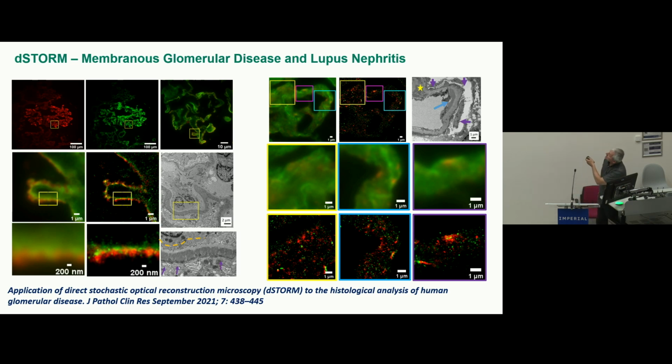We chose this area here in electron microscopy. These dark areas are equivalent to these deposits here in red. Here it is again. This arrow is the annotation of the pathologist. Here are the immune deposits, and this is the reconstruction with fluorescence. This sample takes about a day to prepare manually in the lab with conventional immunofluorescence techniques, primary antibodies. But a sample for electron microscopy could take up to a couple of weeks, just the preparation and the actual imaging with electron microscopy.